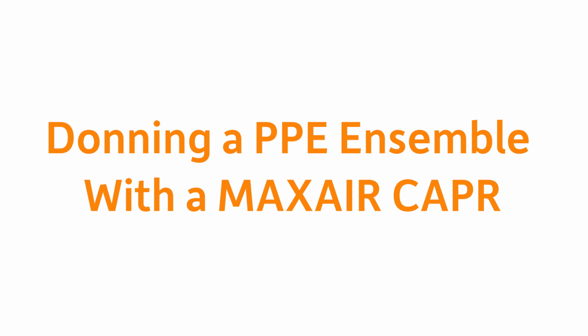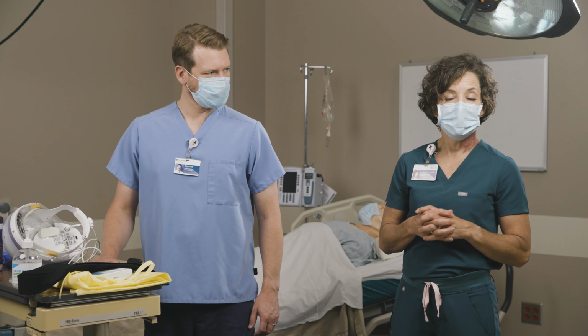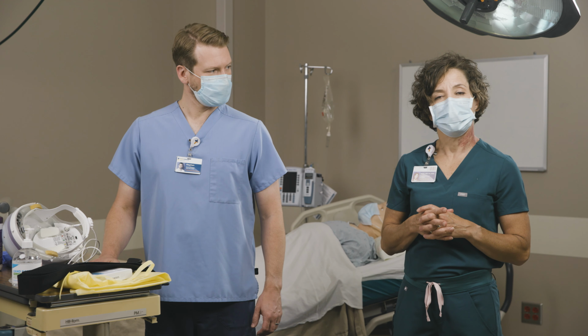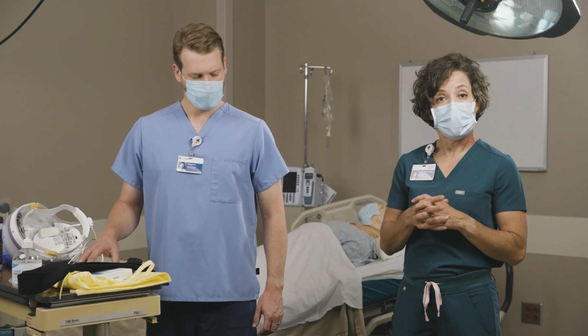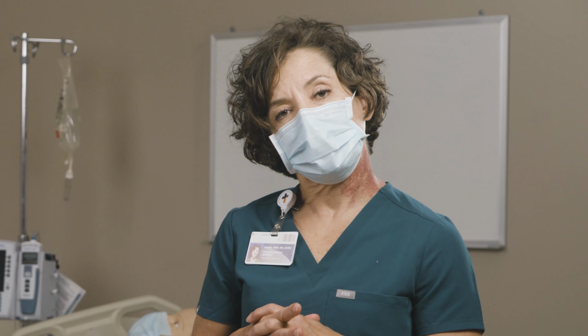Now we're going to demonstrate the donning and doffing of a PPE ensemble with the MAXAIR CAPR. We're also going to utilize the two glove method for this. In our last demonstration, we utilized the one glove method, and this time we're going to do the two glove.